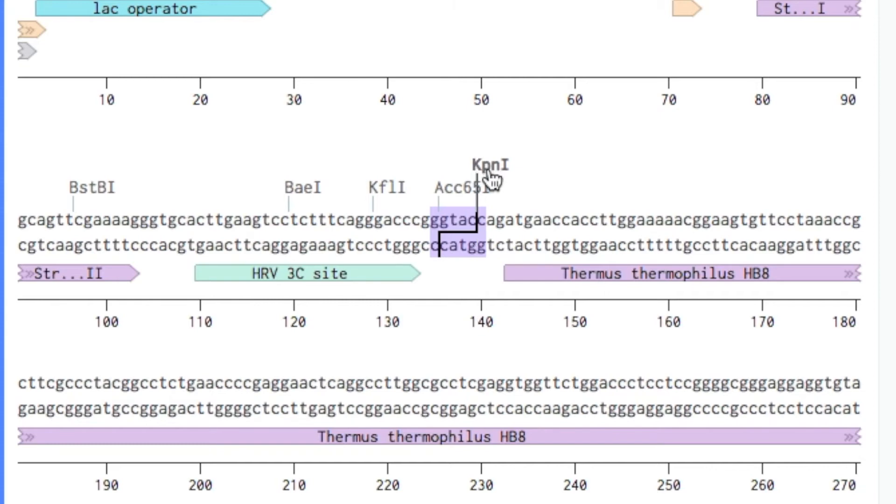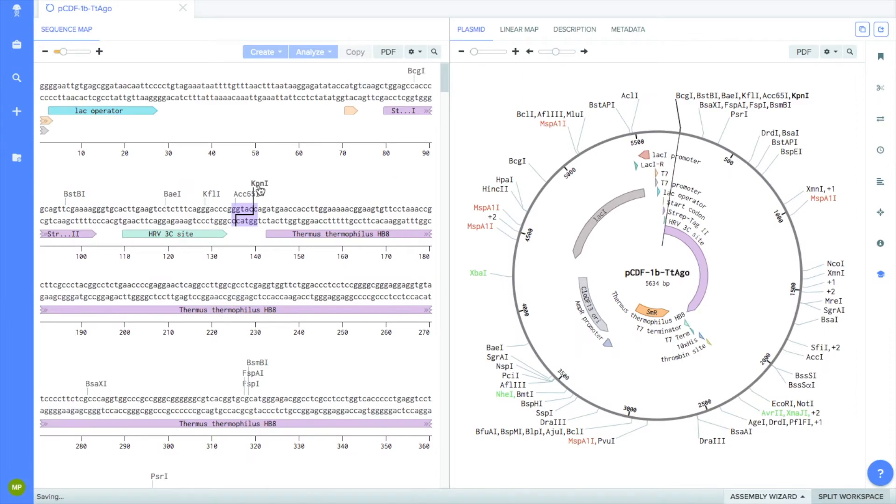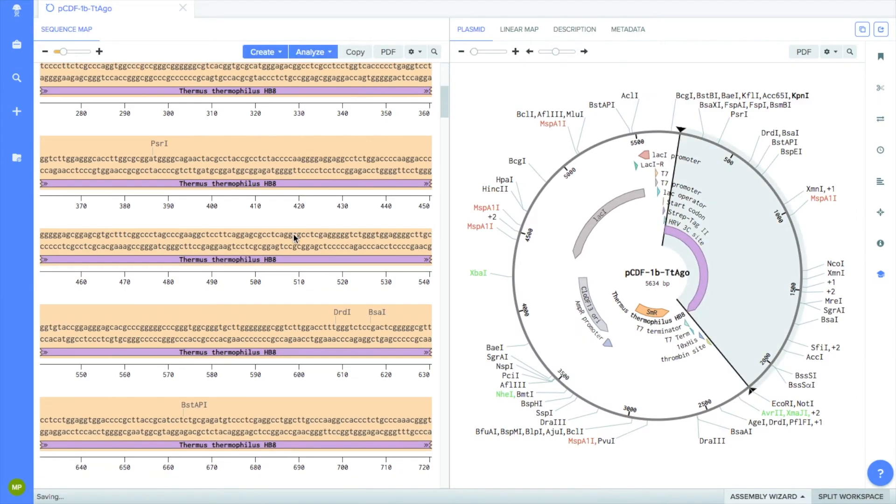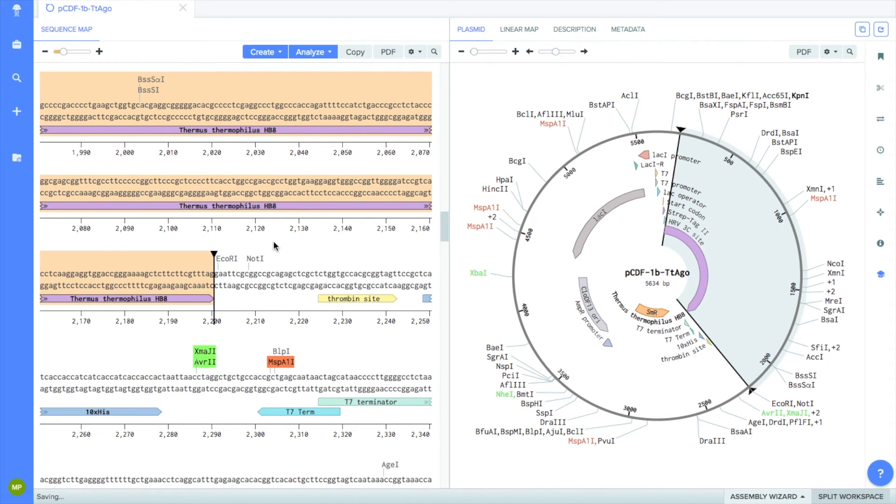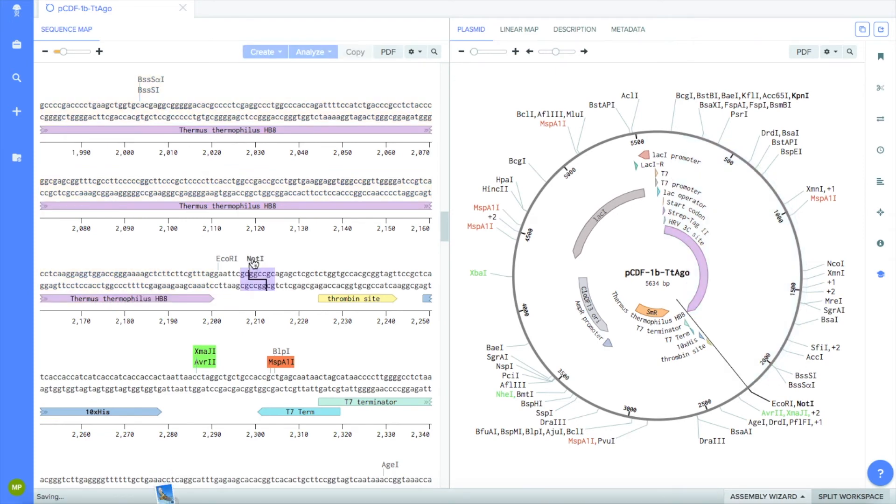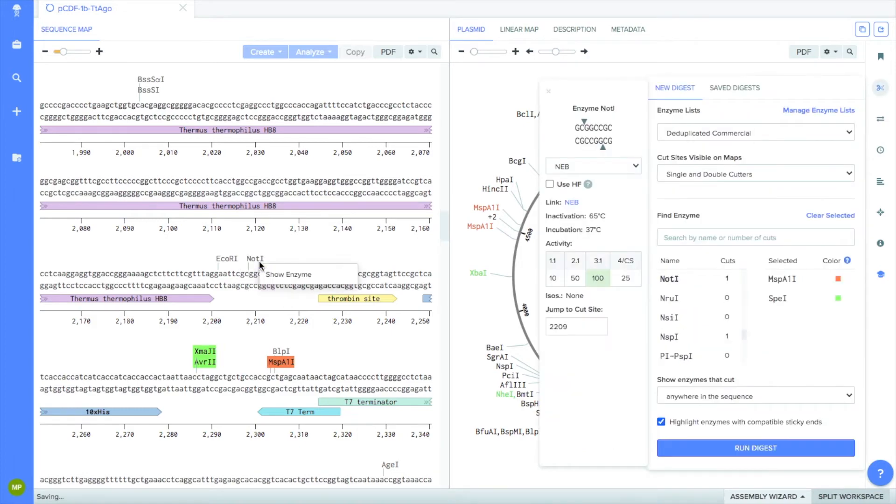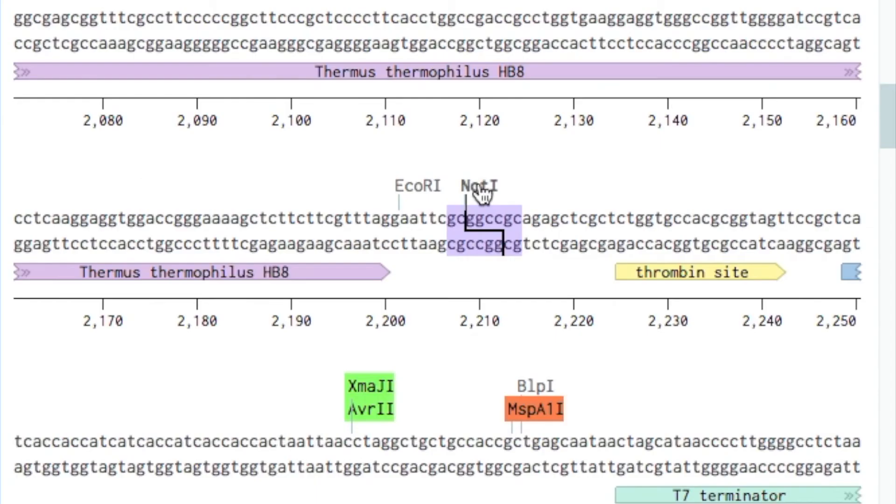Now, let's find a restriction site towards the end of our TT-Ago gene. There are two restriction sites, ECOR1 and NOT1. Let's go ahead and use NOT1. If you click on NOT1, you can see where it cuts and the target sequence. NOT1 leaves a four base pair overhang, creating a sticky end.